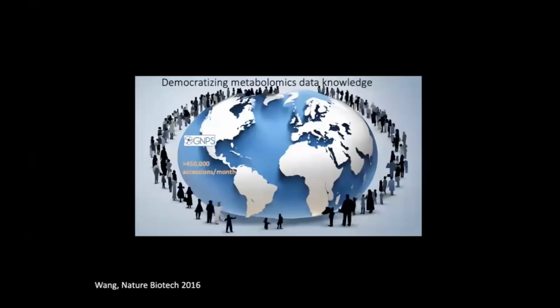And so what does that look like? The initial infrastructure that we built is a data repository, and this is built on top of the MassIVE repository supported by NIH for proteomic storage, but we have a component that also collects metabolomics data, particularly untargeted metabolomics data. We also capture knowledge, so any annotation that you have, any known molecule where you have spectra, or if you have metadata attached to it, we try to capture that into this ecosystem as well.